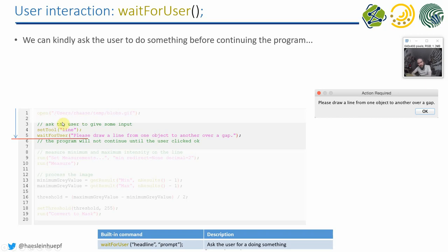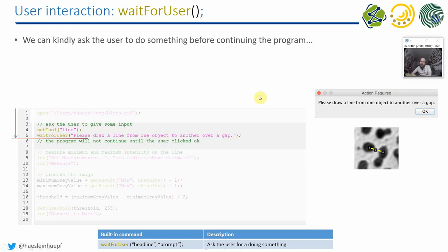So the program execution comes and does some things. For example, it opens an image, and then it comes to the point where you program the waitForUser dialogue. You can also tell the user a bit what to do. Then this window will pop up, and the continuation of the execution is stopped. So the program is not further executed until the user clicks on OK.